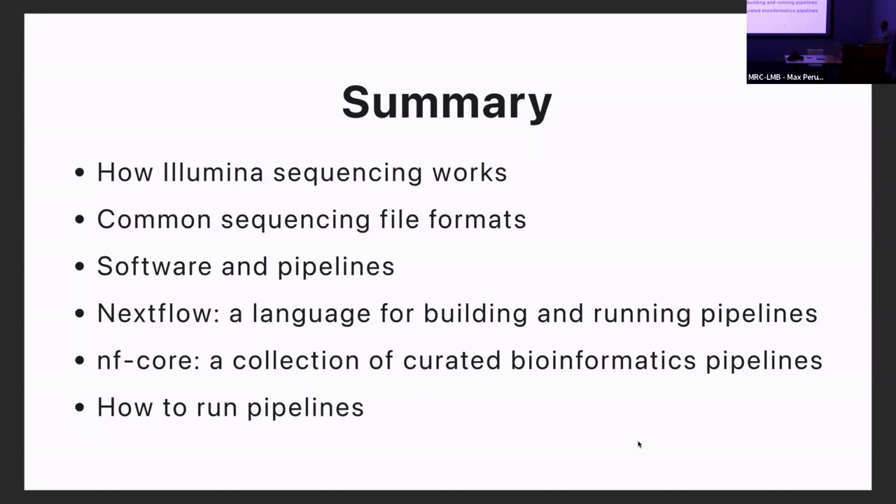And then I introduced the idea of joining these different software tools together using pipelining language, such as Nextflow. And not only can you write pipelines using Nextflow, there's already a whole range of pre-compiled, pre-produced pipelines produced by a consortium of experts at nf-core, which are available for you to download. You can have a go at using some of these yourselves on the cluster. And I've given you a little bit of introduction on how to run the pipelines as well.